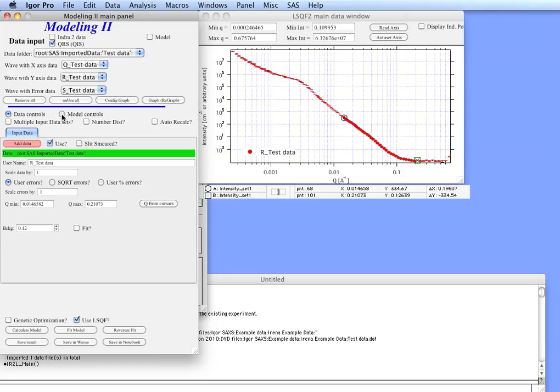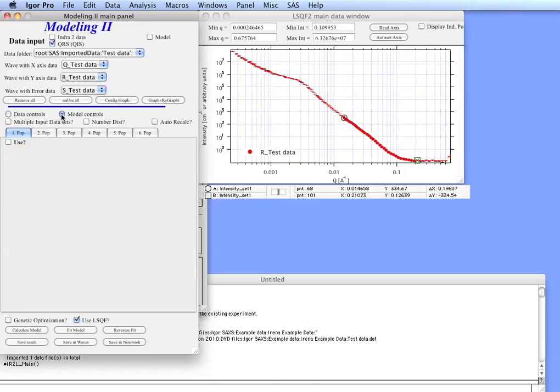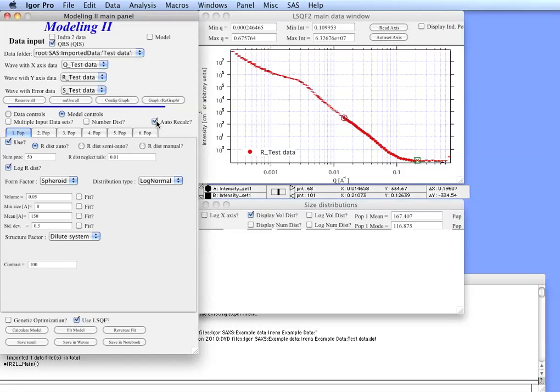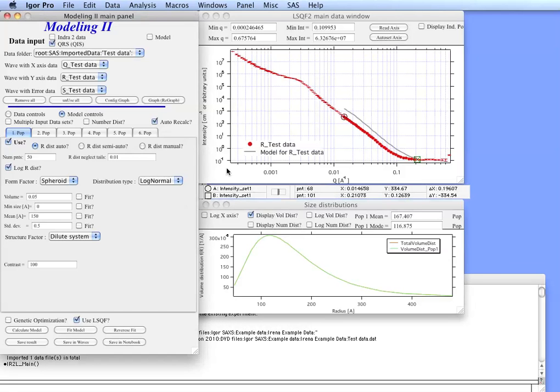Now we can go to model controls. We have up to six populations of scatterers we can put in the model. Let's select the first population here. Just for simplicity, since these are calculated really quickly, we can use autorecalculate. So we check on this and now we have created the size distribution.